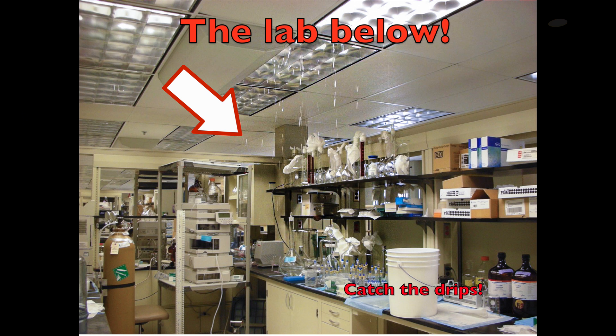— the chance of water dripping into the oil bath, causing superheated steam to blow the oil all over the fume hood, with the potential fire risk associated with that.